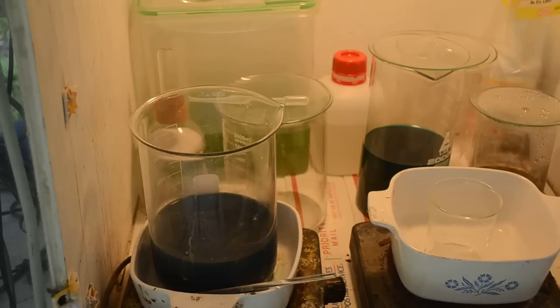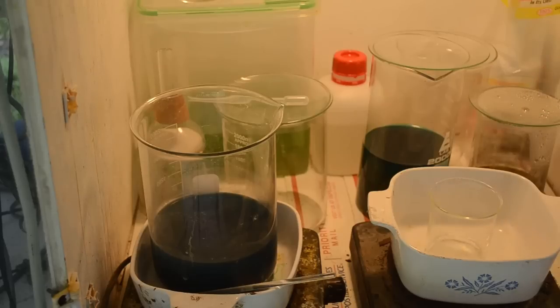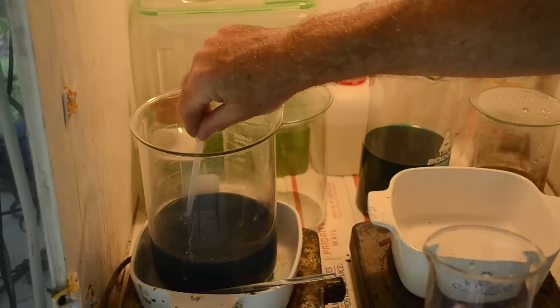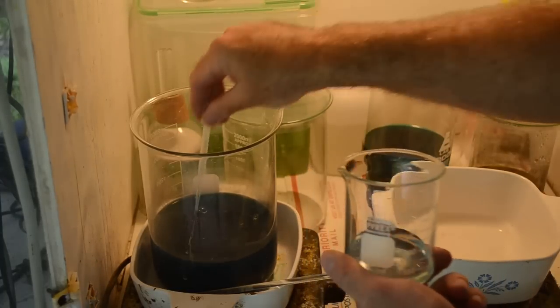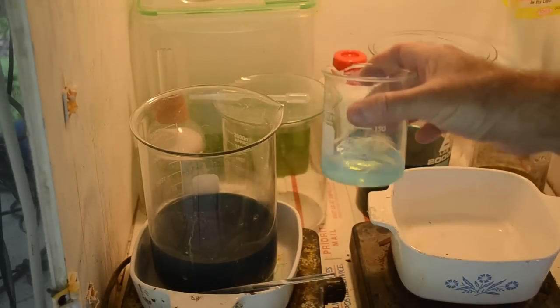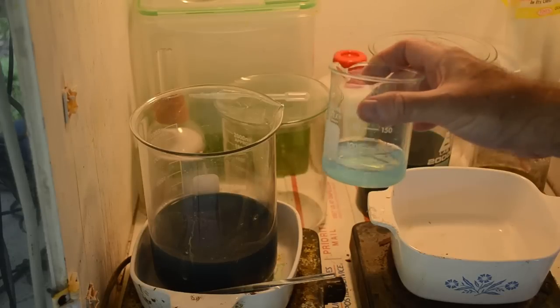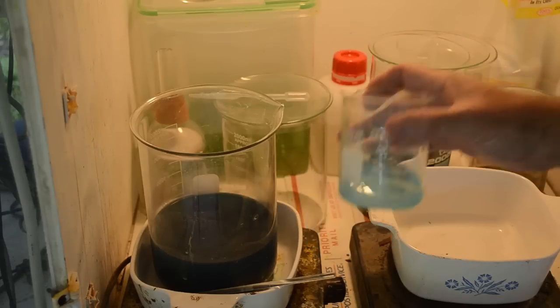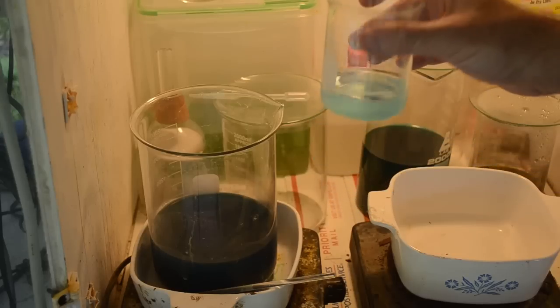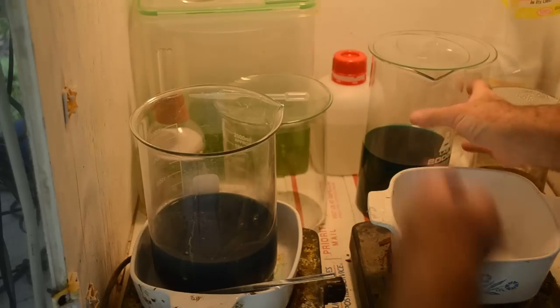First I want to test to see if we've got silver in solution. I'll put a little bit of the liquid from the beaker into some tap water. That is no longer clear — it's nice and cloudy now. That's silver chloride forming: the silver nitrate in solution is reacting with the chlorine in the tap water to make silver chloride. So we've got some silver — at least a little bit. Silver's always a bonus, but I'm really hoping we find some gold.